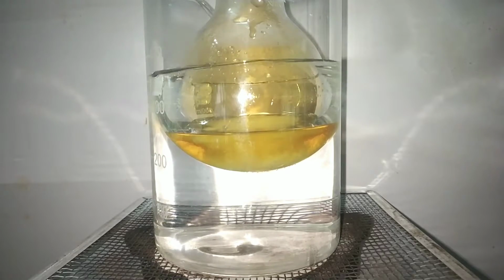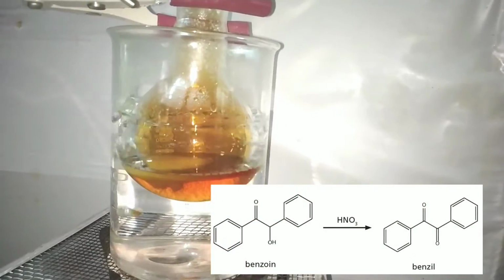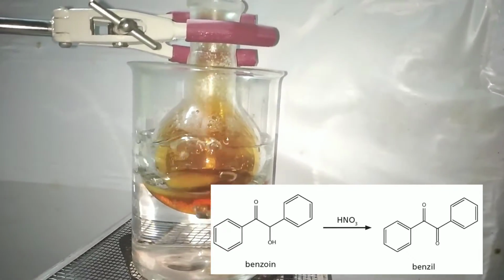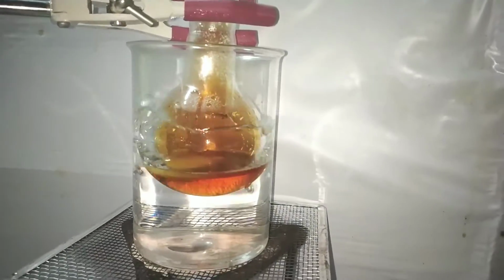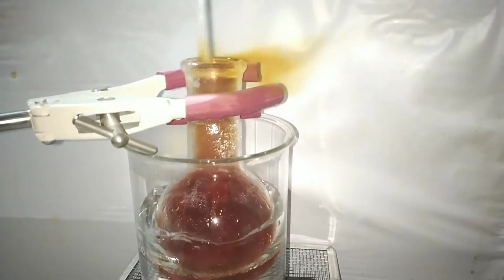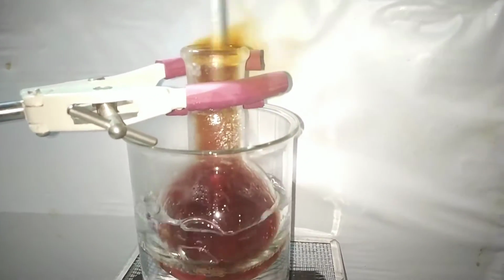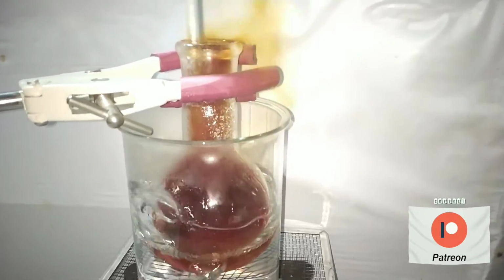What is happening here is the oxidation of the hydroxyl group of benzoin to form a ketone group, and that is the Benzil molecule. This oxidation is not only carried out by nitric acid but also by other oxidizing agents like ammonium nitrate. Continue heating the solution and the brown vapors of nitrogen dioxide are seen evolving from the flask.